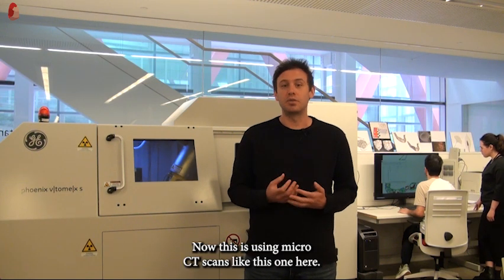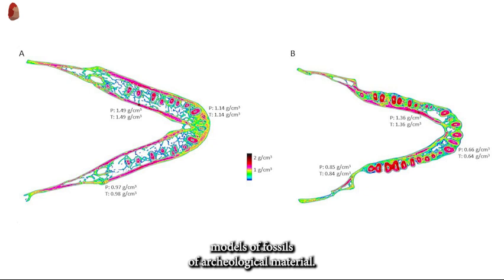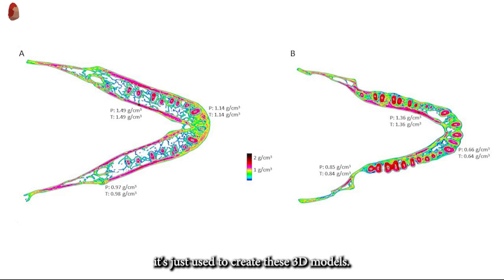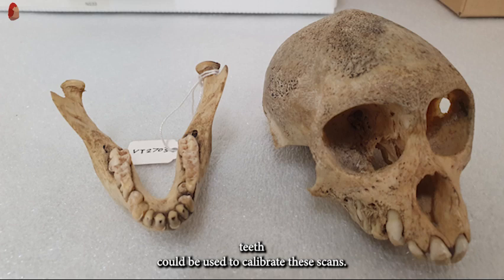Now, this is using micro-CT scans like this one here. These are higher resolution than the CT scans. And from this, you can create 3D models of fossils, of archaeological material. But typically, the density of the actual bone tissue is not studied. It's just used to create these 3D models. So we wanted to see if, especially in archaeological material, teeth could be used to calibrate these scans.